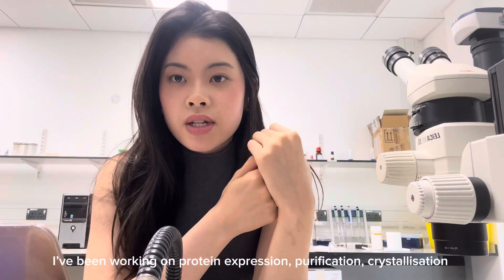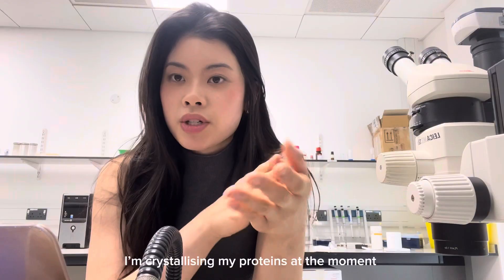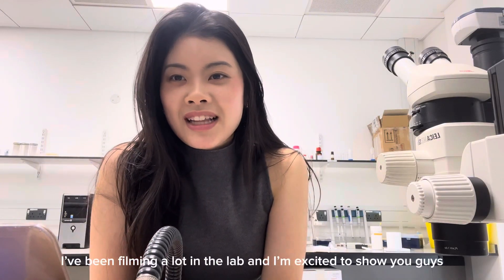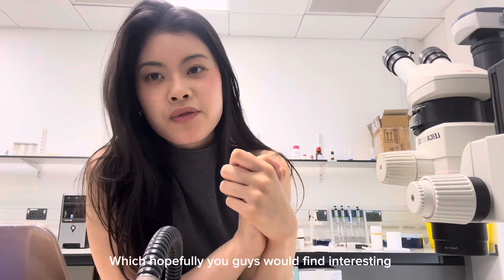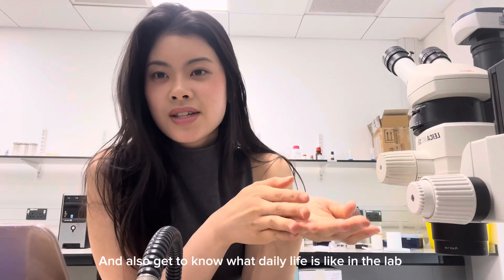I've been working on protein expression, purification, and also crystallization. I'm crystallizing my proteins at the moment and I'm really excited to see the structure of it later on. I've been very excited to show you guys how it's like to work here, the experiments I've done which hopefully you'd find interesting, and also you could get to know more about what daily life is in the lab.